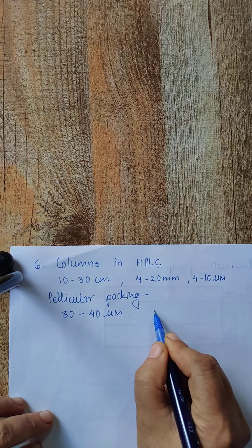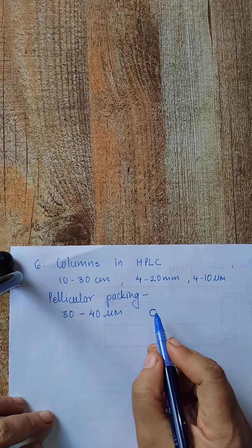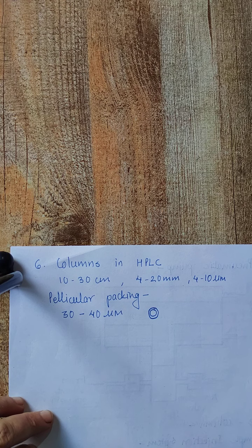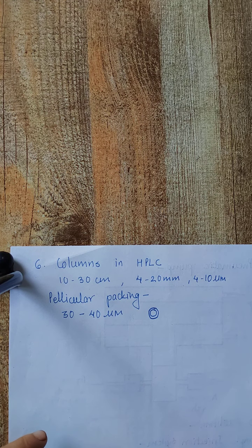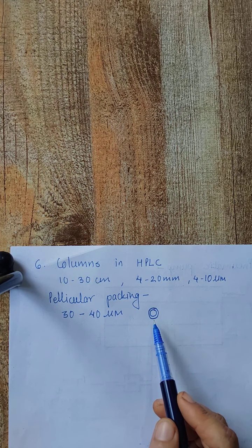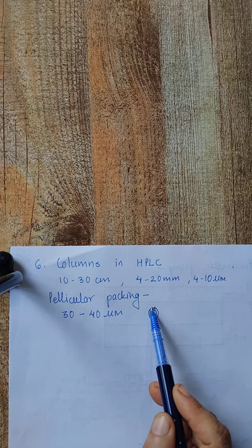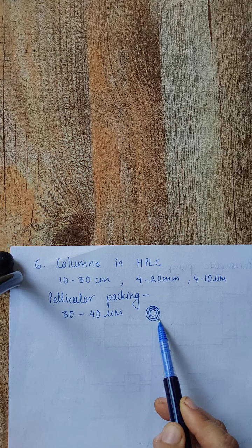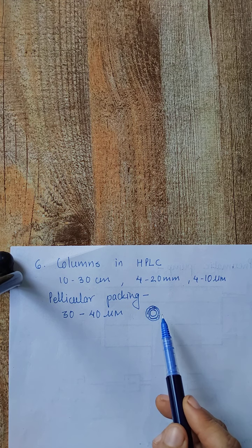A thin layer of silica, alumina, polystyrene divinylbenzene synthetic resin, or an ion exchange resin is deposited on these beads. Sometimes an additional coating is applied which consists of a liquid stationary phase, or the beads are chemically treated to give an organic surface layer on which the liquid stationary phase is present.